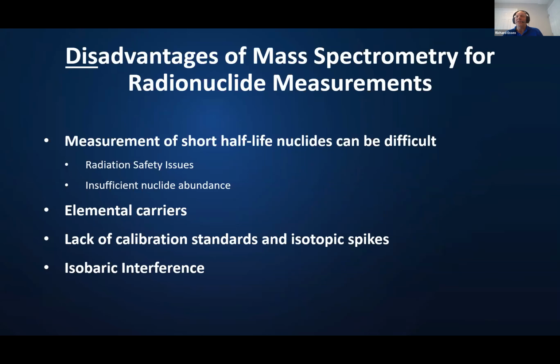That creates significant problems for measuring those things by ICP-MS, because you've saturated your sample with something that isn't of interest. Sometimes you can get around that. But for instance, in a cesium sample, maybe you have so much carrier that we have to dilute a tremendous amount to put it in an ICP-MS, and therefore the precision of your measurement of cesium-135 or 137 is hard to achieve by mass spectrometry.